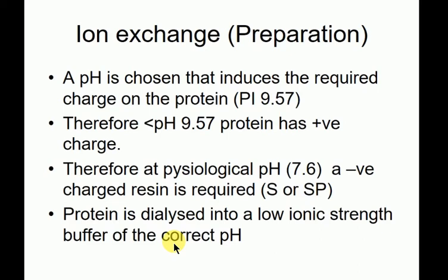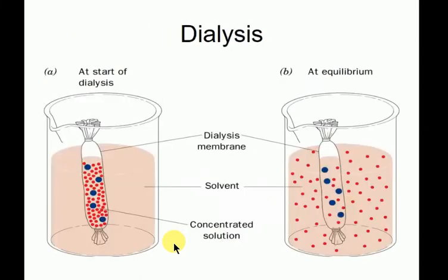And the other thing you should think about, right, is cells don't really use sodium at high concentrations. Most cells use potassium. So I wouldn't always try sodium chloride, I'd try potassium too. That might be friendlier to your protein. Off you go. You put your protein in a dialysis bag. Then you'd have a defined composition of salt in your solvent, and it would exchange out. If your buffer is really expensive, then instead of doing one big bulk exchange, you would do 2 small ones, and they'd have the same effect.